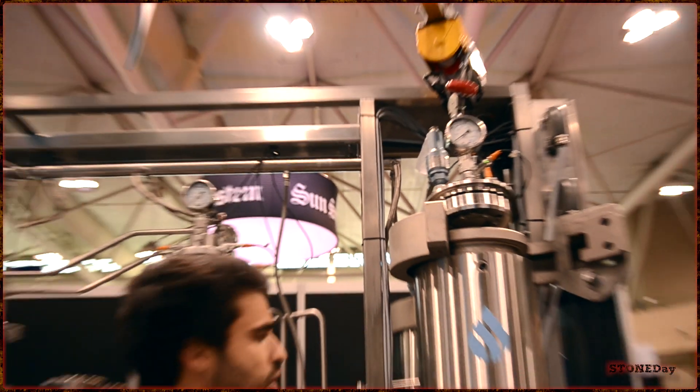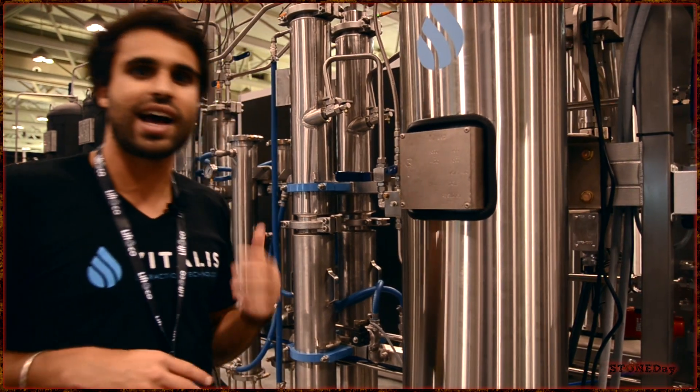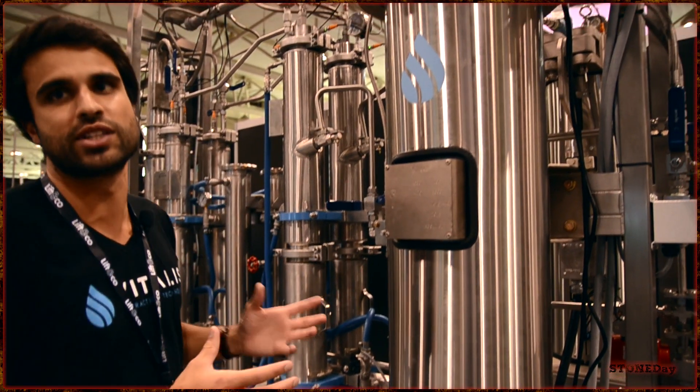And this is pressurized pretty heavily. So if you're doing a supercritical run — supercritical, if you're not aware, is a stage between liquid and a gas. So gaseous CO2 at a higher temperature: instead of having a gas, you can compress it down and it'll be half gas, half liquid. And that's what this whole system is designed on.